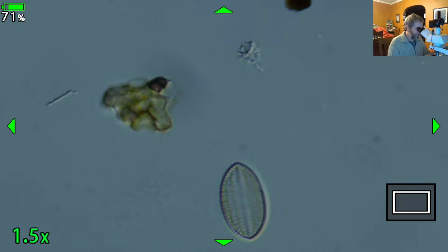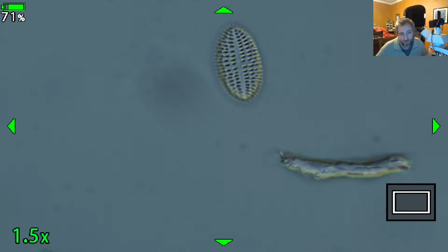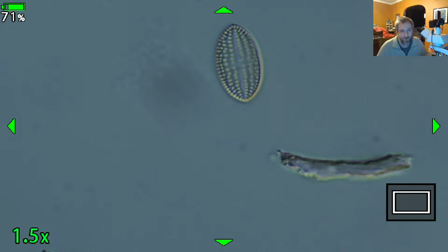Here's a little tiny Cocconeis. This is basically the size that we usually see them. Let's see if I can get it in the field of view. Yeah, okay. This is a different species. This is like neodiminuta. So I think it's Cocconeis neodiminuta, or close to that. Maybe diminuta.